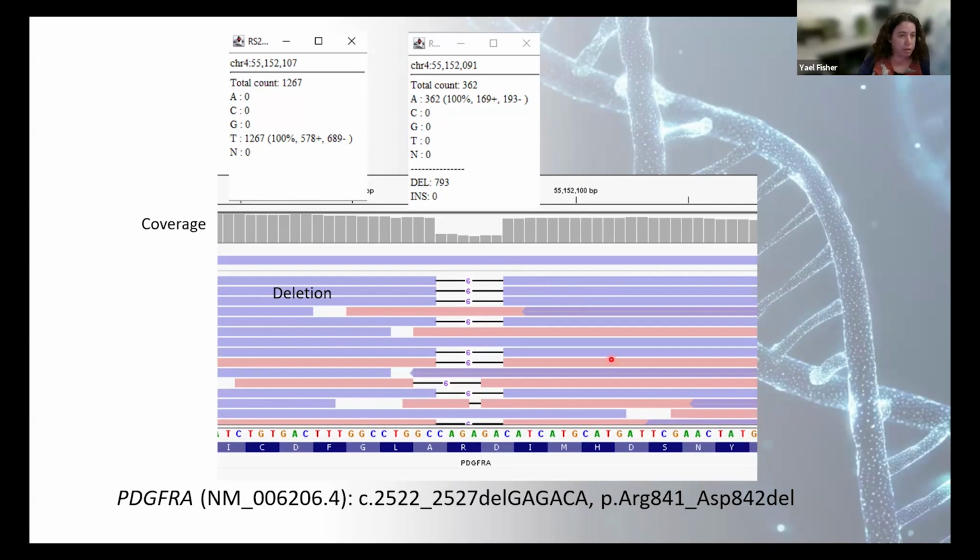Another thing I should mention is that in some views of IGV, you're going to get blue and red sequences. You can customize that for yourself in most versions of IGV. And this means a different direction of read. So the blue is reads that are from right to left, and red is reads that are from left to right.